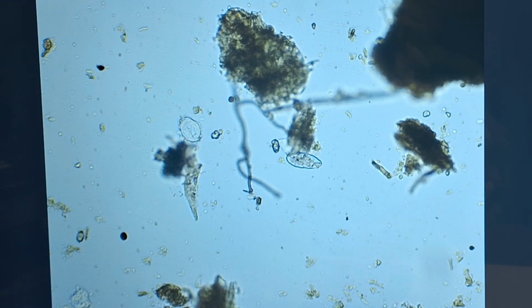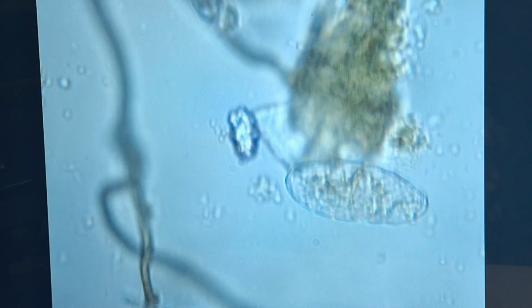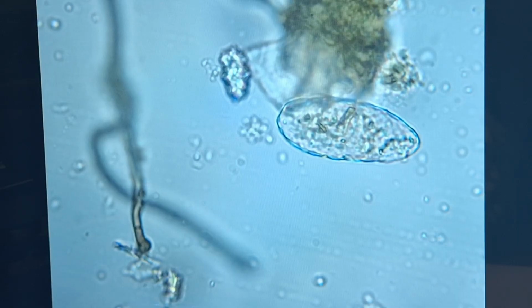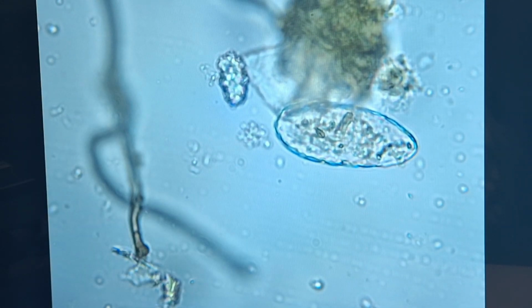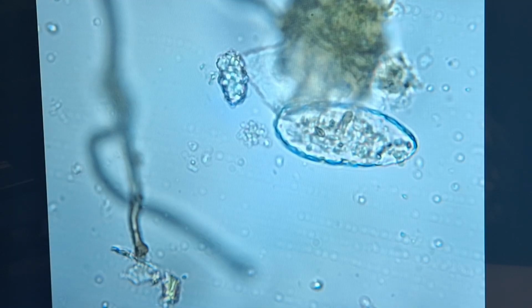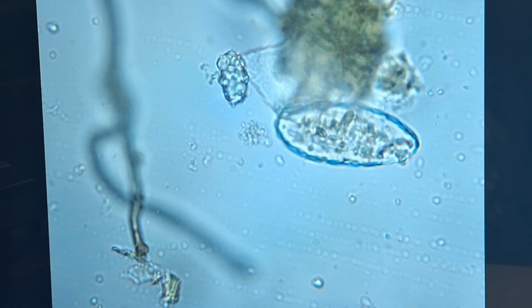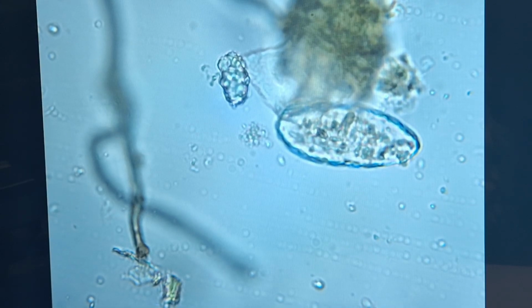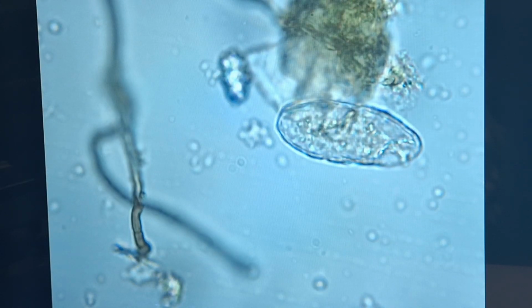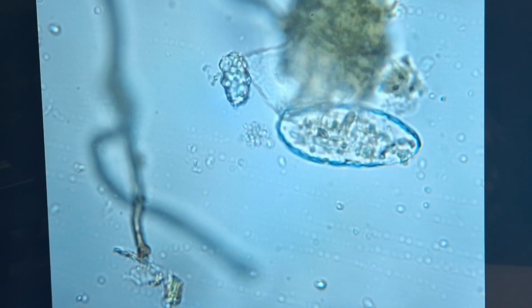The more time you spend on the microscope, the more you'll be able to pick out those shapes and sizes. Again, the bacteria all around it, different shapes and sizes. Now that we're zoomed into 400 again, I believe that testate's moving. You can see it moving live. All the food inside of it, what it's been feeding on. It's a very good example there.